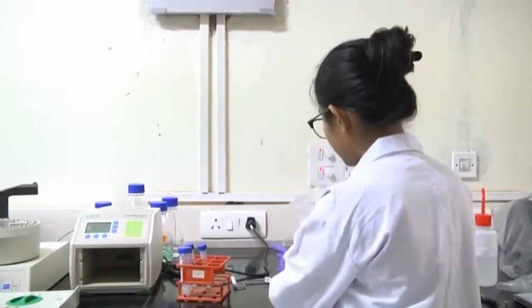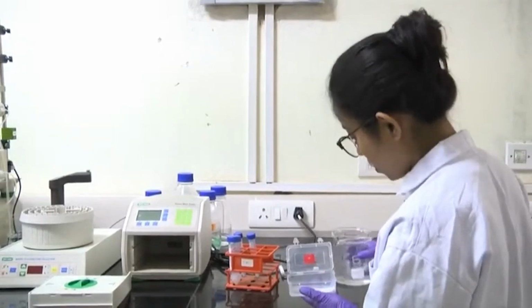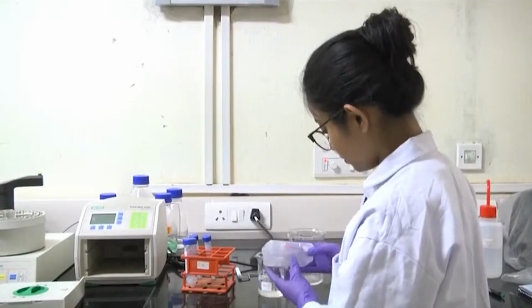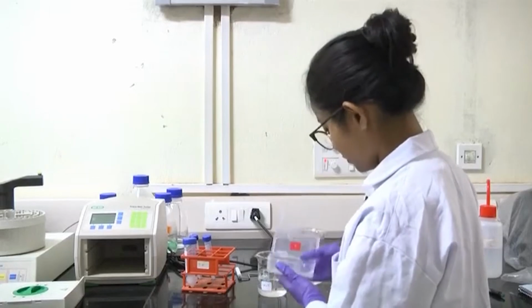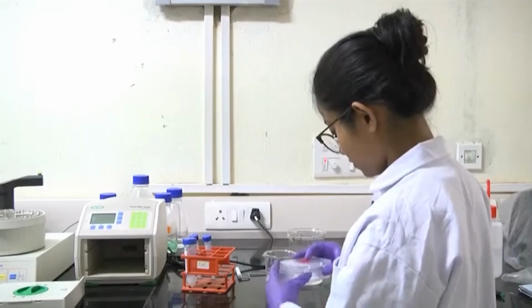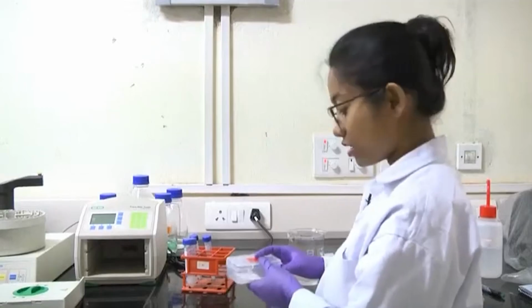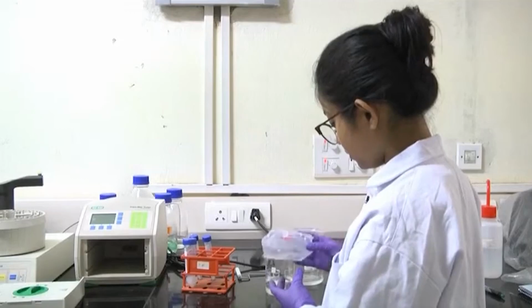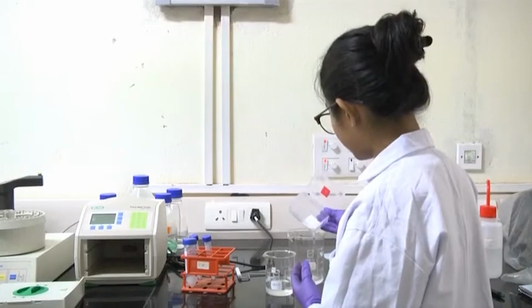Around 3 times we will wash to remove the blocking solution. You can also keep it for 5 minutes in the rocking motion and wash 2 to 3 times with the solution to sufficiently remove the skim milk.